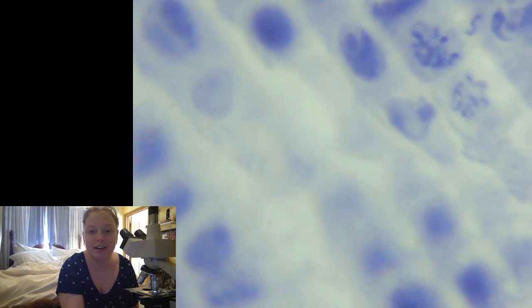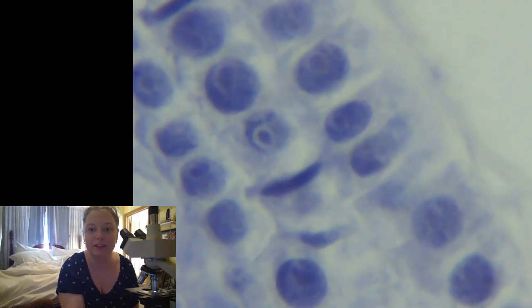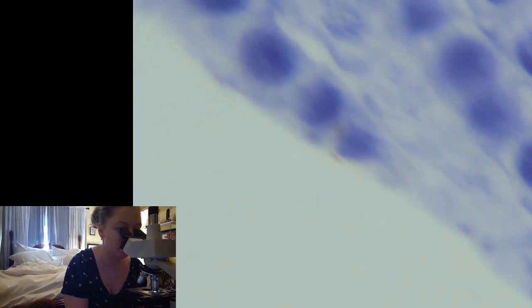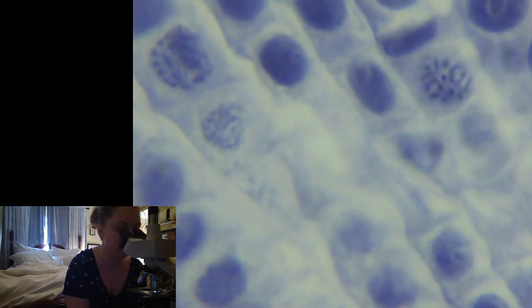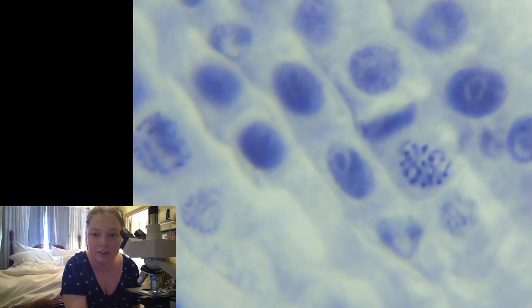And what's interesting about it is that when it's actually in real life, it's not ever as clear as what we're used to seeing in the pictures. You know, like when we look at a cell in anaphase, we're used to seeing them like those little A's out to the side, but it's really hard to find them like that in real life. Let's see if I can get this one. There's this cool one right here. Let's see if I can get that one out. It's hard, your viewing screen is not as, there, that one is kind of neat.